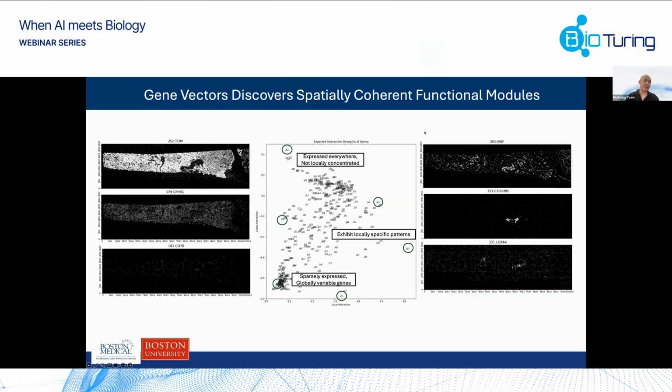Right. And Ruben, what is the scalability of Giotto? Can it be applied to the whole transcriptome, and how many transcripts does it support? Scalability of which one? What the audience wants to ask is whether you support whole transcriptome analysis or just a few genes. Oh no, we do. We support the whole transcriptome analysis.